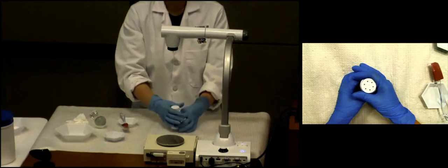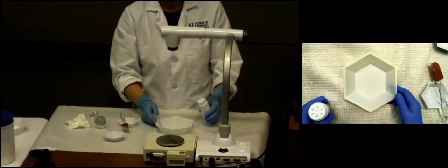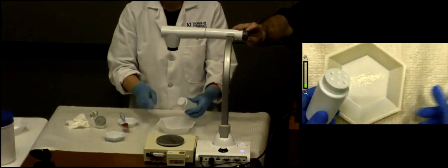Okay, great. So if you turn the lid, you can see the shaking hole there. And remember, I had a little bit more than I need, right? Because I want to test it out before I dispense to my patient. That looks really nice. I'm happy with my product.